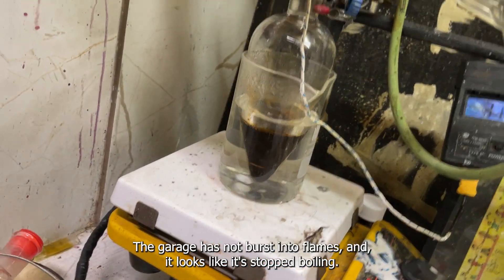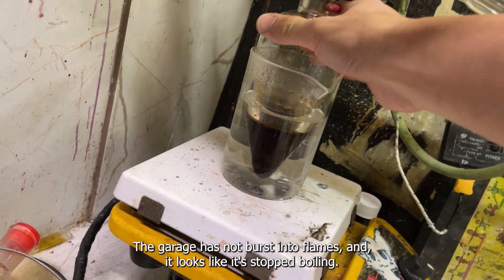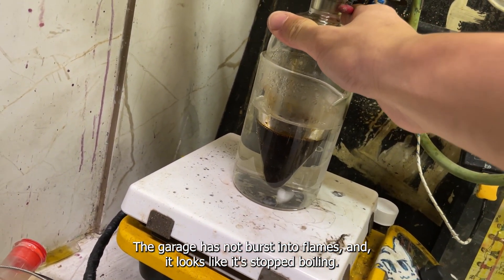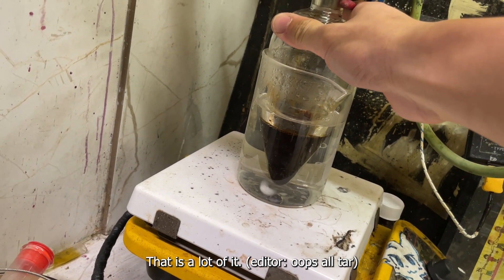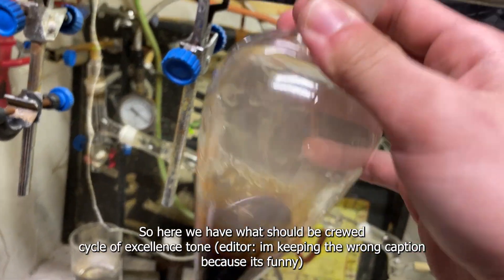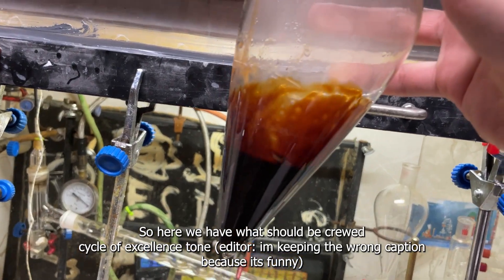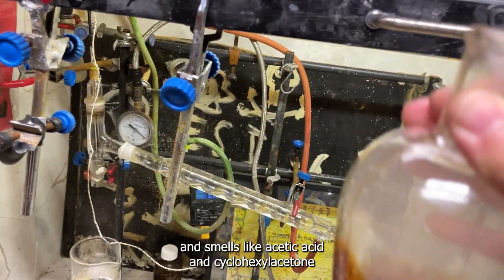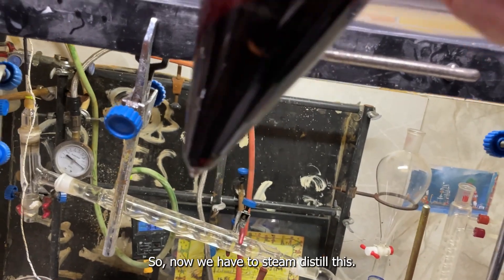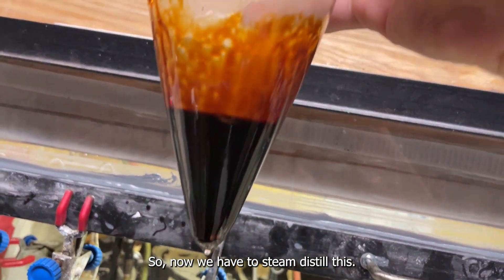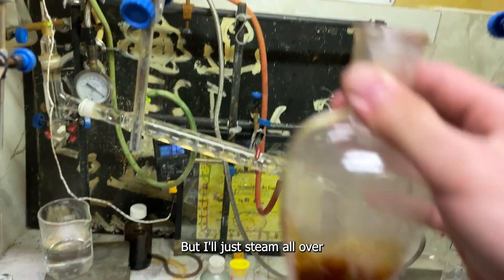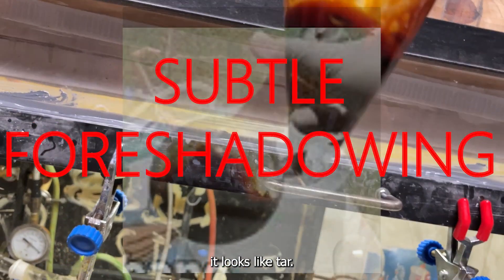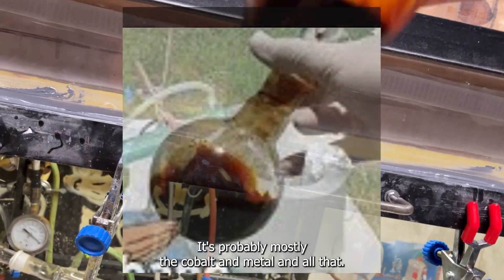Okay it's been about three hours, the garage has not burst into flames, and it looks like it's stopped boiling. I think this is our crude cyclohexyl acetone, that is a lot of it. Here we have the crude cyclohexyl acetone and it smells like acetic acid and cyclohexyl acetone. Now I have to steam distill this. There's probably still some acetic acid in there but I'll just steam this all over. It looks like tar, it's probably mostly cobalt metal and all that.